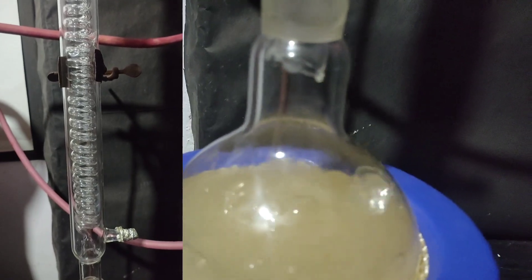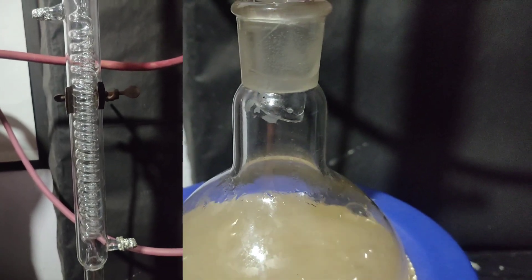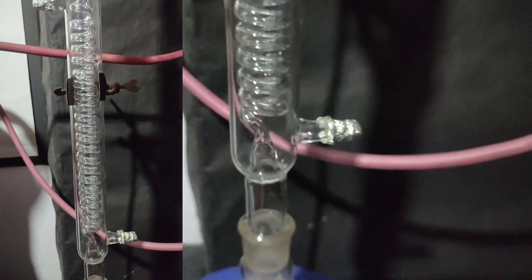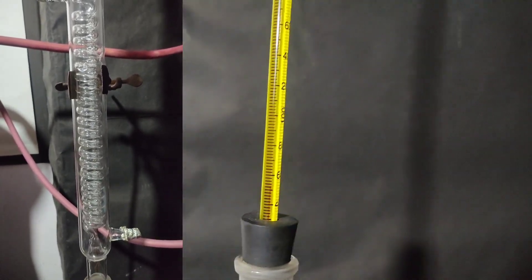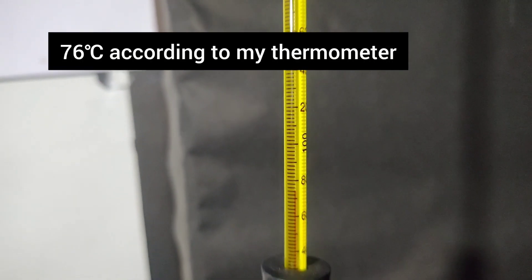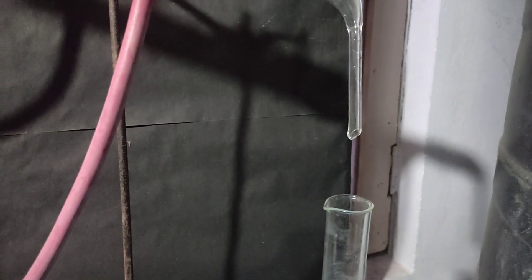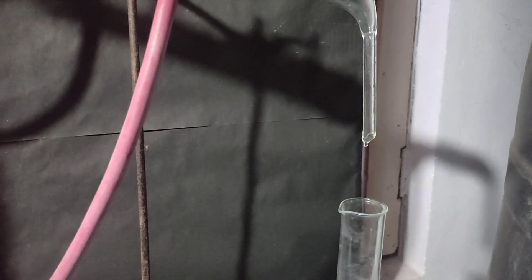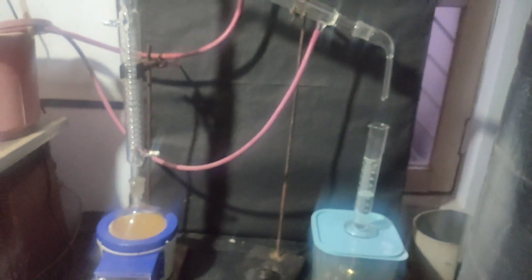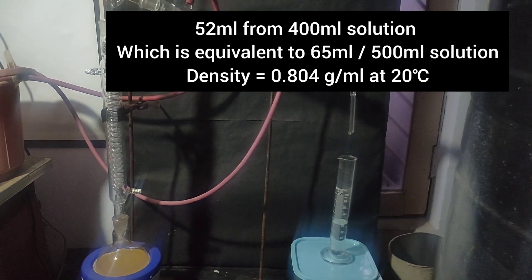This Graham's condenser is 30cm. You can see vapour condensing in the spirals and refluxing. At 78 degrees Celsius, we started receiving distillate.